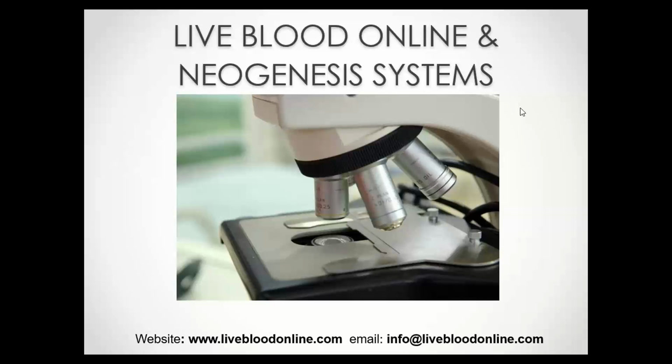And then the process also of the client being able to see the condition of their blood for themselves is always valuable in practice because it helps to improve compliance. It quickly becomes a crucial part of your practice, and since it often uncovers things that you would never have thought of testing for or considering in your assessment of a case, you would probably feel that you might be missing crucial information about your client and your case if you're not using it as part of your assessment. Your clients also tend to expect you to check their blood. They often come in specifically to see what their blood looks like.